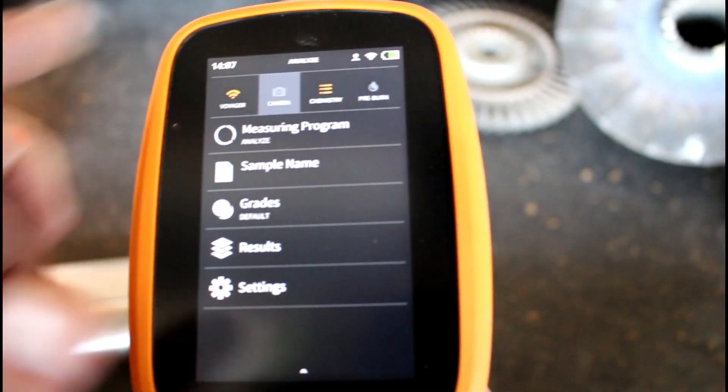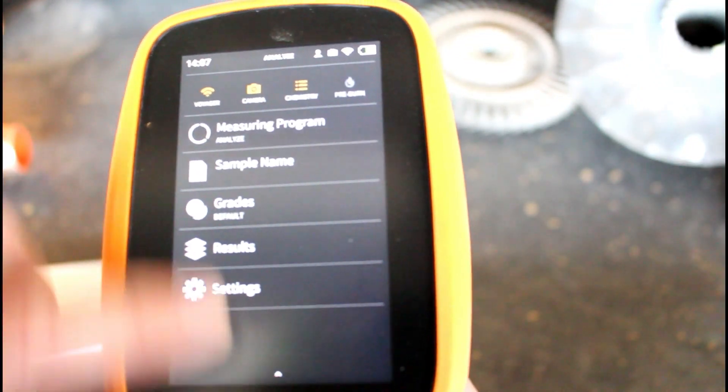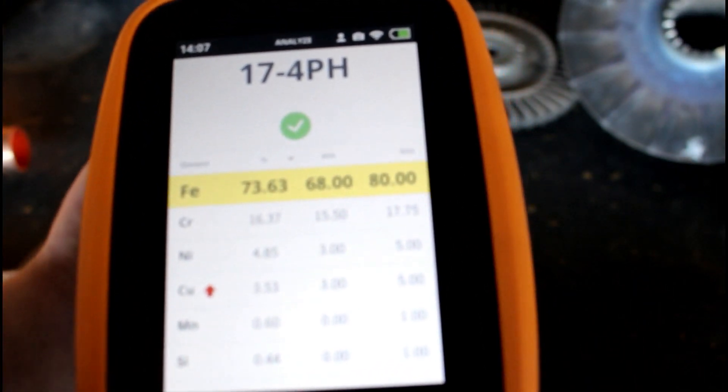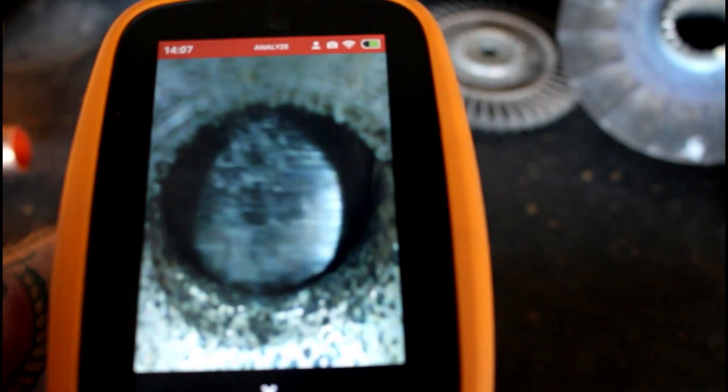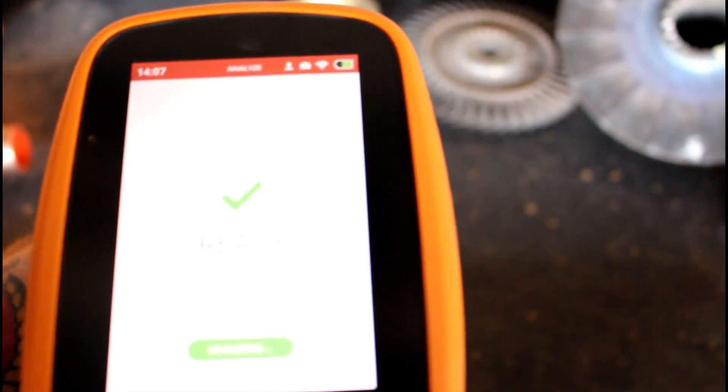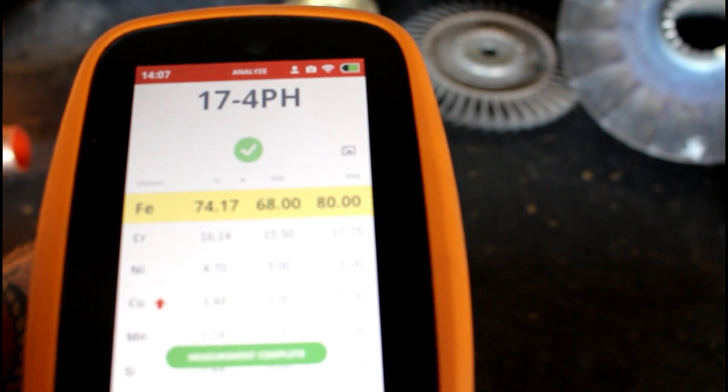Now I'm gonna turn on the camera function that it has. When you set up with the camera and put metal up to it, that's actually a camera that shows you the metal and where you're gonna shoot it. And it's done.